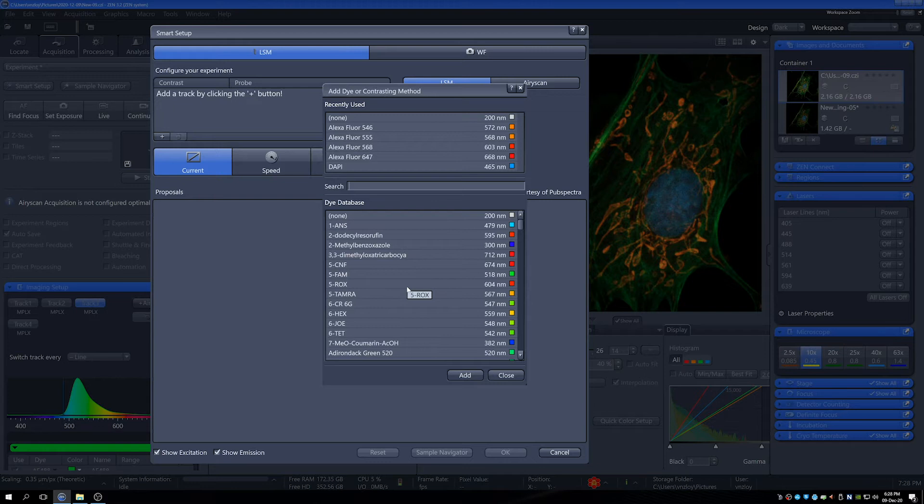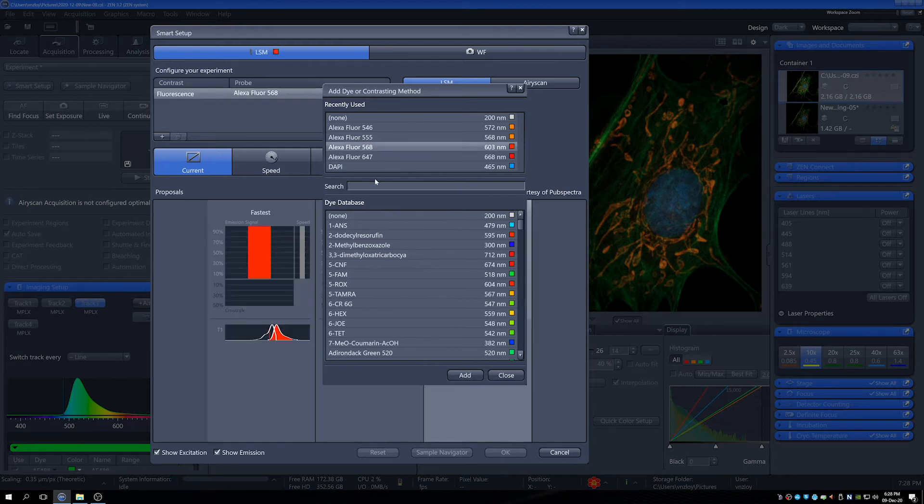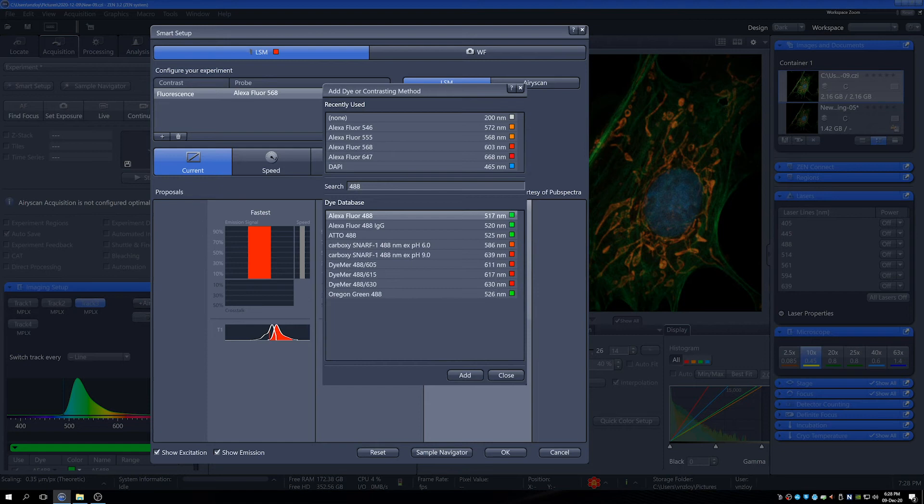There's a big range of dyes that you can use. For the rat kidney we will need 488 and 568. So we'll use those. I've got 568 here, and if I want 488, then I can use that just there.